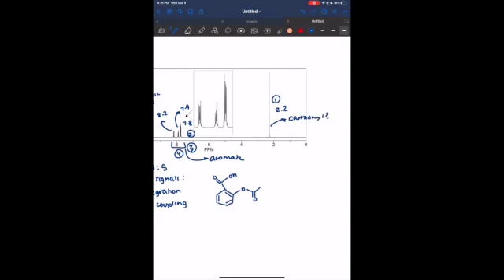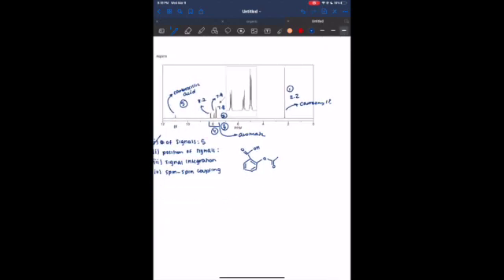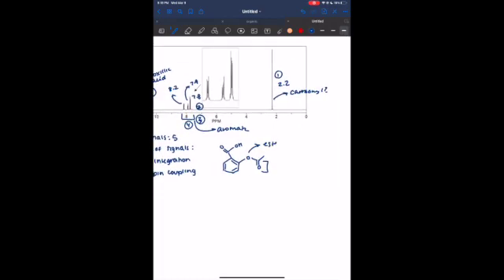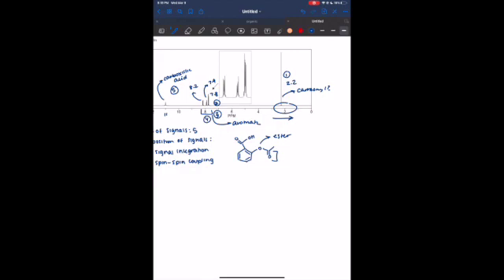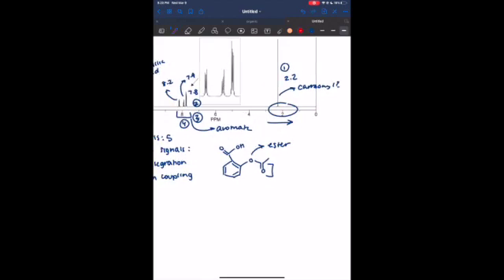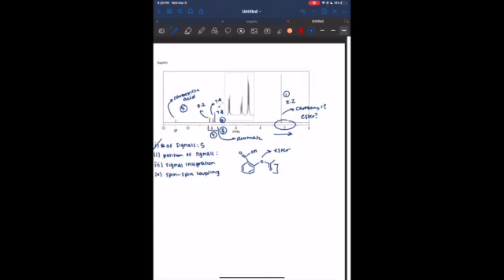What's interesting about this compound is that we do see a carbonyl here, but with this extra oxygen, it actually makes it an ester. And the reason why this signal is shifted upwards from where we would originally see it is due to chemical shifting by the aromatic compound, which is why this could be a little more upfield and could indicate an ester compound. So we're just going to keep that in mind while we go through this.